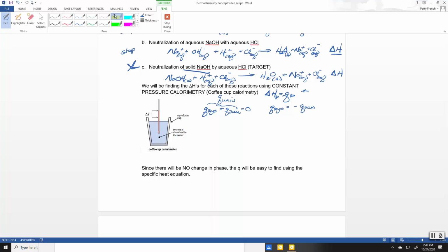Now the Q surroundings are the things we're going to be able to measure. And how is that? Well, Q system is actually, in this case, the Q reaction. System, remember, is the thing that you're studying, and what we're studying is the reaction. The way we can measure it is by observing what happens to the solution, which is the surroundings. So this is the surroundings. What's actually happening inside with the dissolution or the reaction is the system. Okay? So the surroundings is simply the resulting solution.